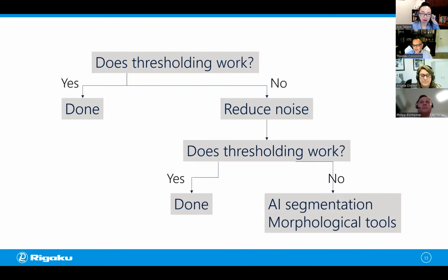So maybe you want to separate pores and identify each of them individually. So that's not correct. Kill borders, anything touching the border gets eliminated. That's not correct. Dilation and erosion are either going to add or subtract, but they're going to do it in a global way. So also not correct. But opening combines dilation and erosion. So it's actually the correct answer in this case.